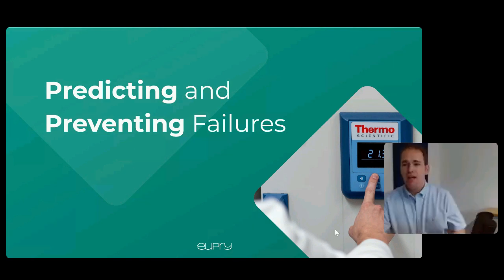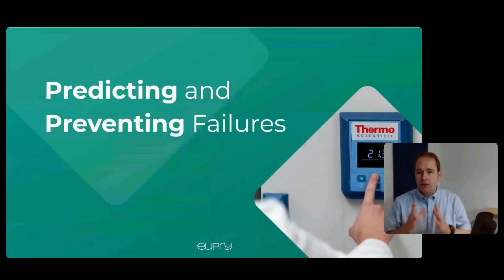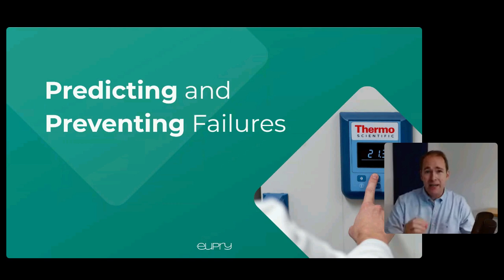Okay, great. Hello, everybody, and thanks for joining us today. So I'm going to be talking, first of all, about predicting and preventing failures. One of the things that I wanted to get across, particularly in this webinar, is it's not just a tick box performing temperature mapping. It's not just something that you have to do, where you put a tick in the box to say, yes, we've done the mapping, that's over. There's a lot that you can take from it.